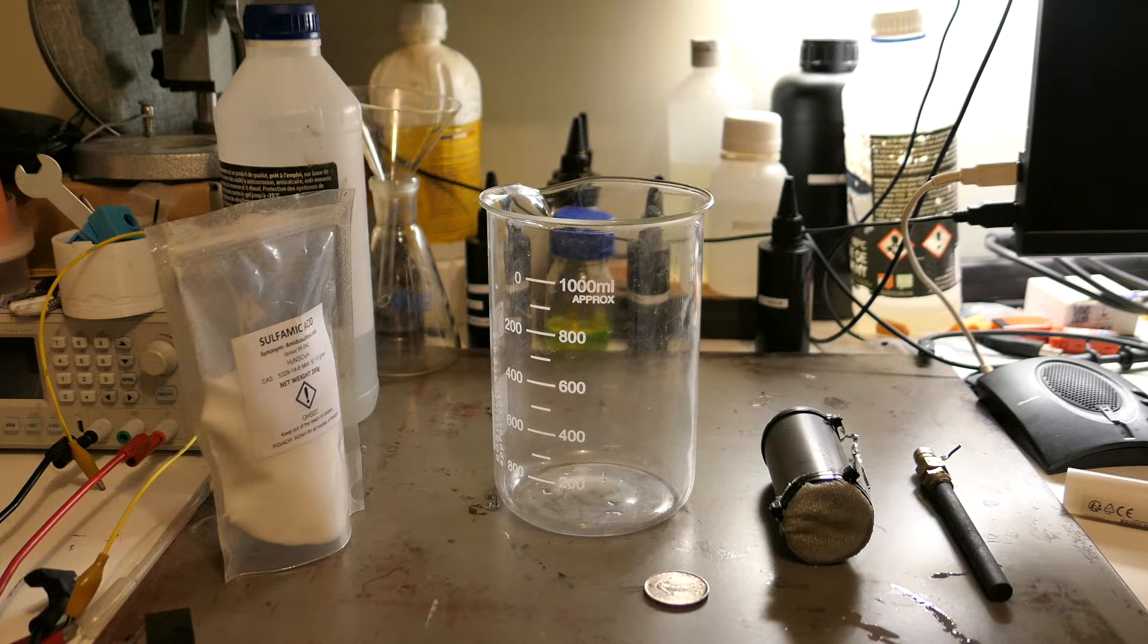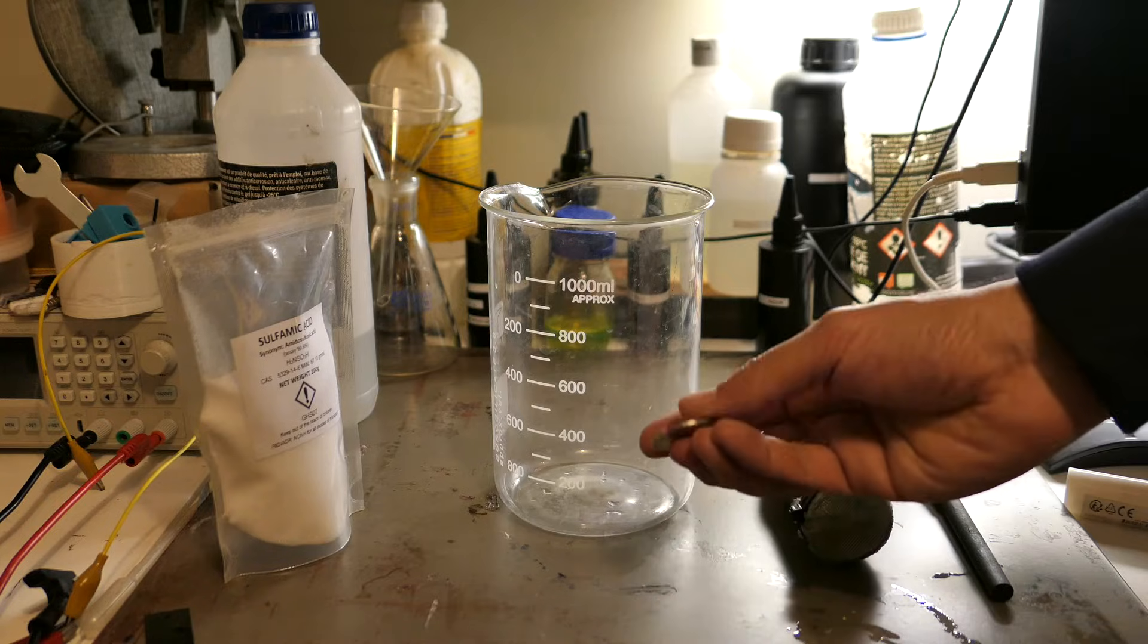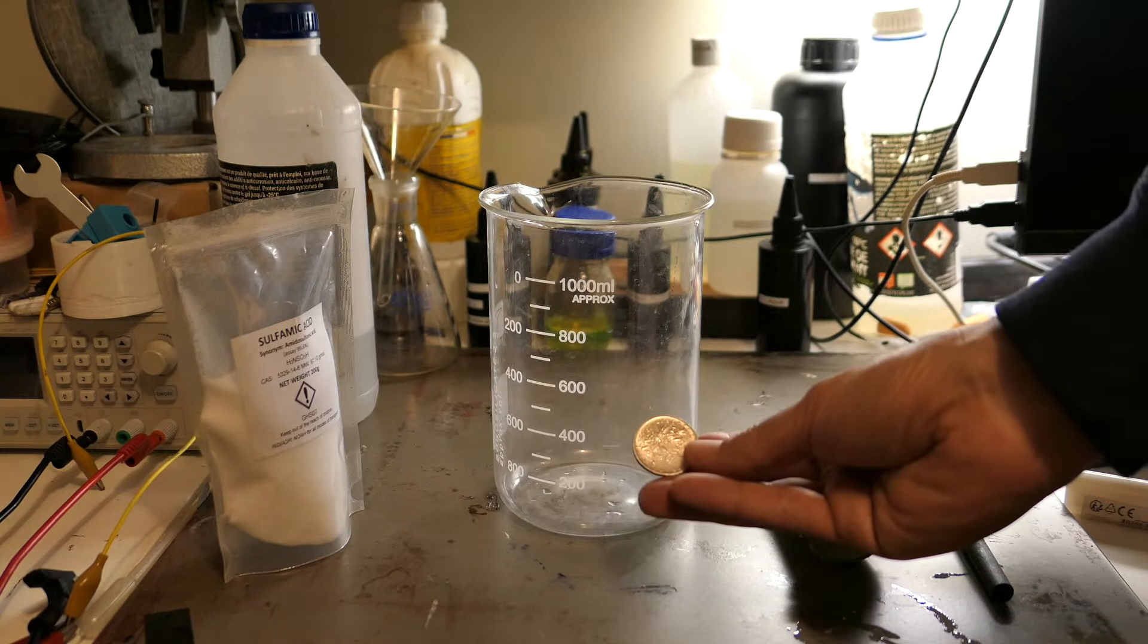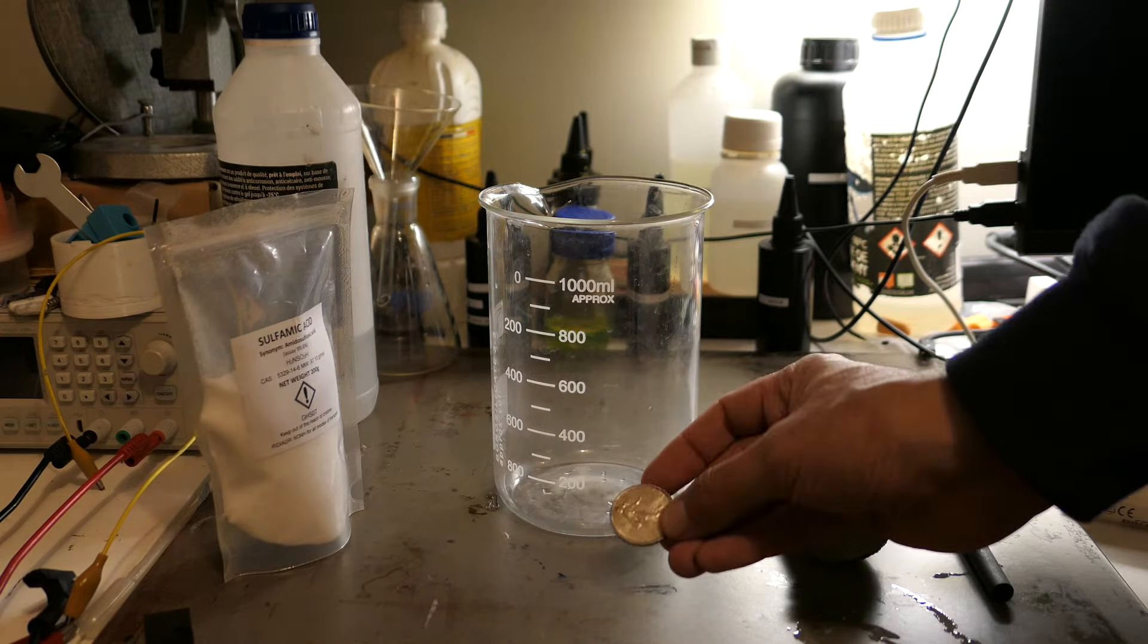Welcome back to the channel. Today we're going to talk about an exciting new method for refining impure silver, such as coins, cutlery, or old jewelry, using an electrolytic cell.